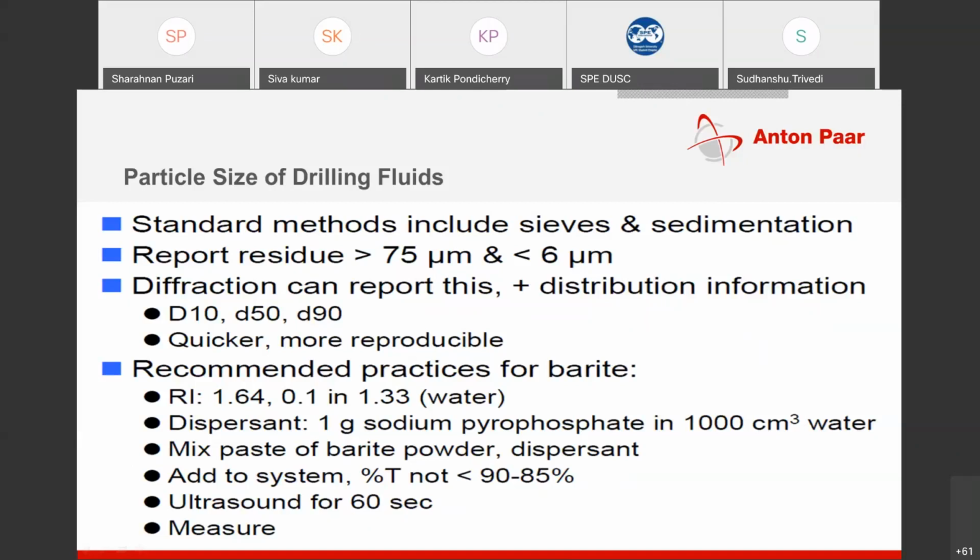If you see the drawback of sieves, sieves measure the second largest dimension of any particle. Suppose you take a pen and put it through a 2 centimeter hole, and keep on flushing that pen with water. The time will come when it will pass through that 2 centimeter hole, because it becomes upright, tilts, and goes through. But it is not the correct interpretation because the pen size is not 2 centimeter.